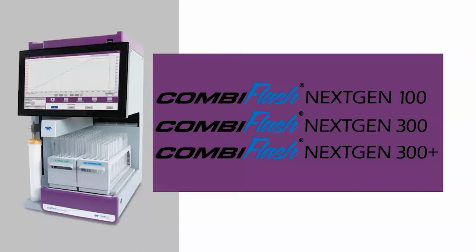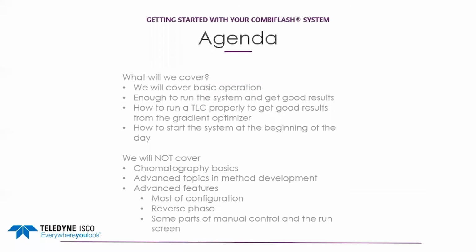There are several types of next-gen instruments and also many older CombiFlash systems. They have different features, so the screens will look a bit different than the ones you will see here on those other systems. However, all of the functions that we will discuss today will be on these systems. You will notice some controls and features in the screenshots that I do not mention. These are advanced controls and will be discussed in a future webinar.